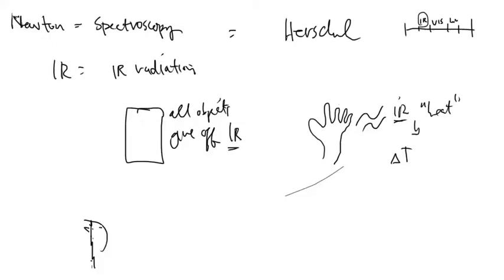Okay, so we are on the last leg of the infrared lecture. Can you believe it? And we've made it through the functional group detection. We've made it through a little bit of the history, not much, but enough to give you a good feel of where this all began. And now we need to talk about the instrument itself.